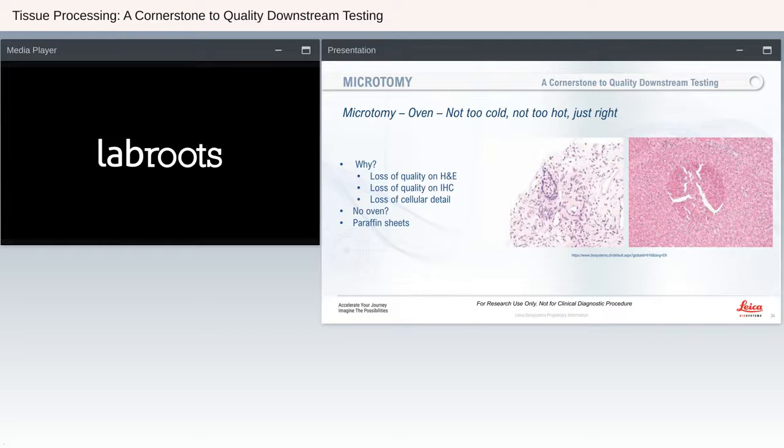And we're seeing that even at that short amount of time, you see loss of antigenicity. I think especially in a lab that is doing a lot of molecular testing, that would want sections that are cut right away. There is a recent article out that talks about if the sections do need to be cut, then coating them with paraffin will preserve that RNA and IHC targets.